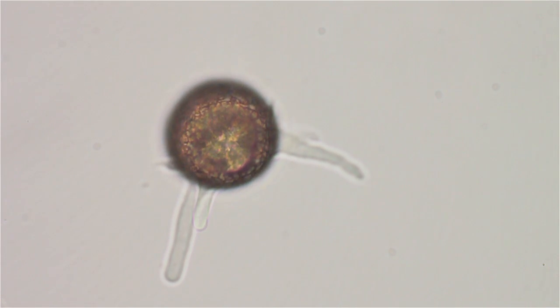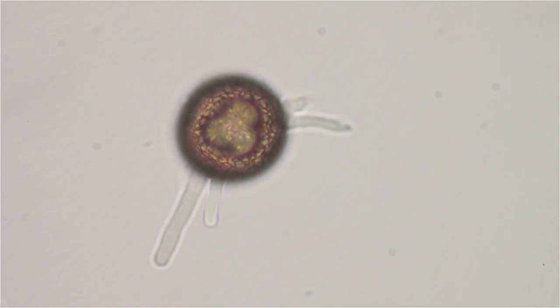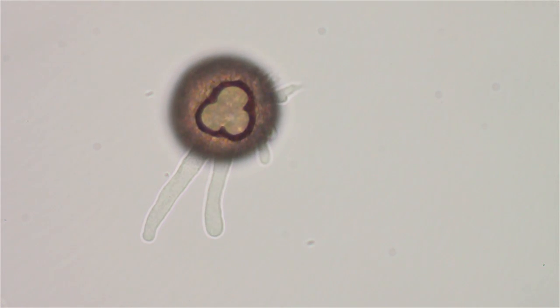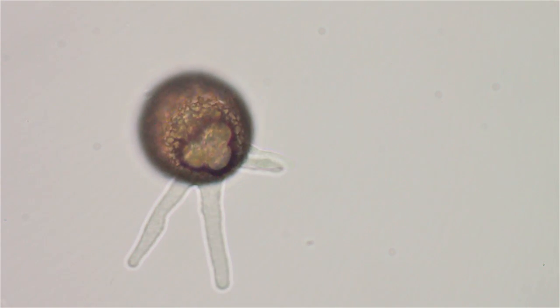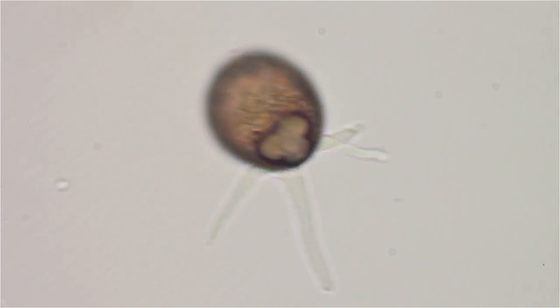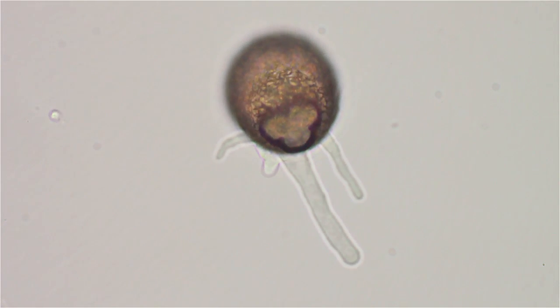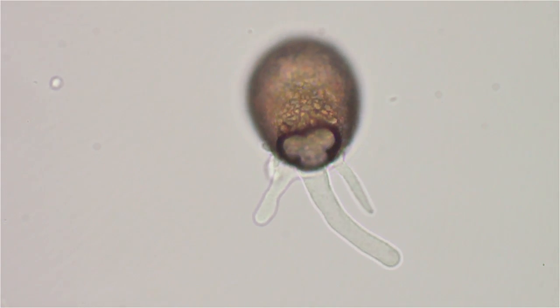I think what I'm going to do is put this guy back in the aquarium, let him multiply by dividing. Hopefully I can catch another one like him sometime from my aquarium. He's pretty active, huh?